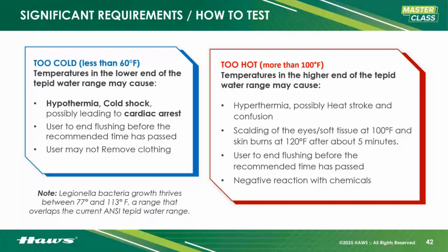Again, 127 degrees I ran into once. That was just crazy. I couldn't believe it. You know what? I even have the video. Maybe I'll put it in the next webinar. But there's steam coming off of the eye wash.